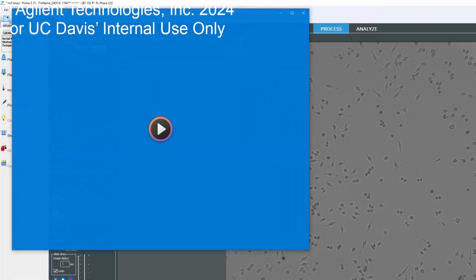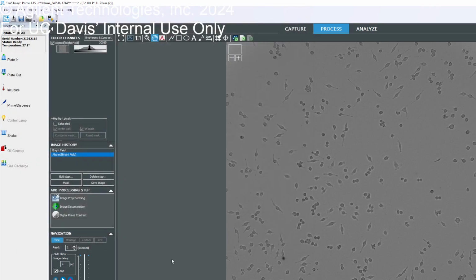We have 2 copies of the Gen 5 program. Yeah, oh, it's pretty fast, right? Yeah. I'm not sure if we have it. Okay, that's good. Yeah. And then save the experiment. Yeah. And I right click, create experiment.